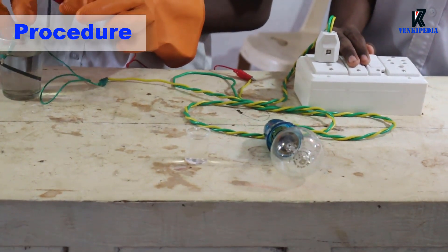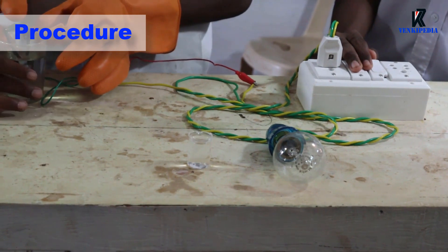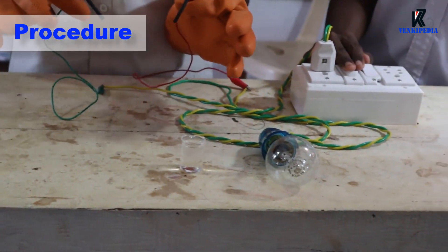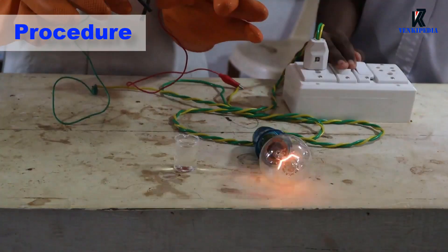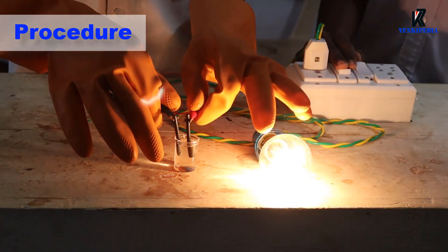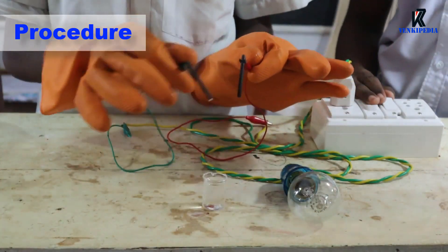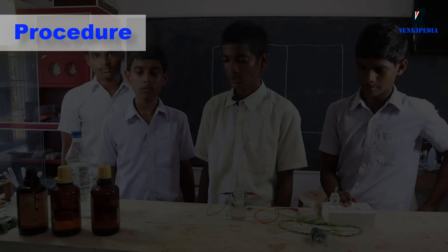Wash the graphite rods again with distilled water. Now test the conductivity of the dilute HCl. We can see that the bulb glows. This indicates that dilute HCl passes electricity through it.